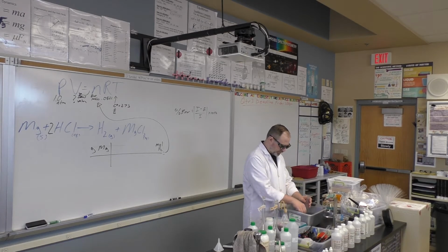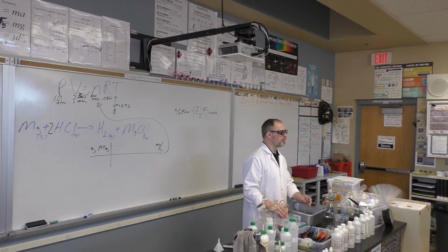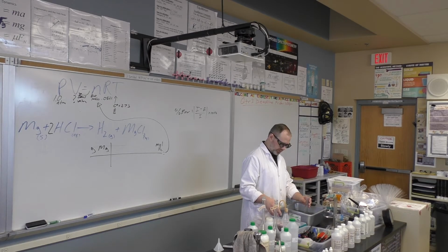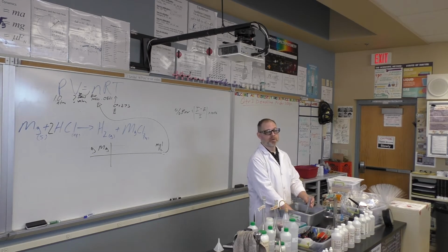And now we're passing a mass of gas through a glass in class again. Yay! But we're not going to worry about the mass of the gas. You can shake it if you want to speed the reaction up a little bit. You can kind of swirl it. It doesn't really make a huge difference because the bubbles are all up in the tube. We don't care about the mass of the gas. We care about the volume of the gas.